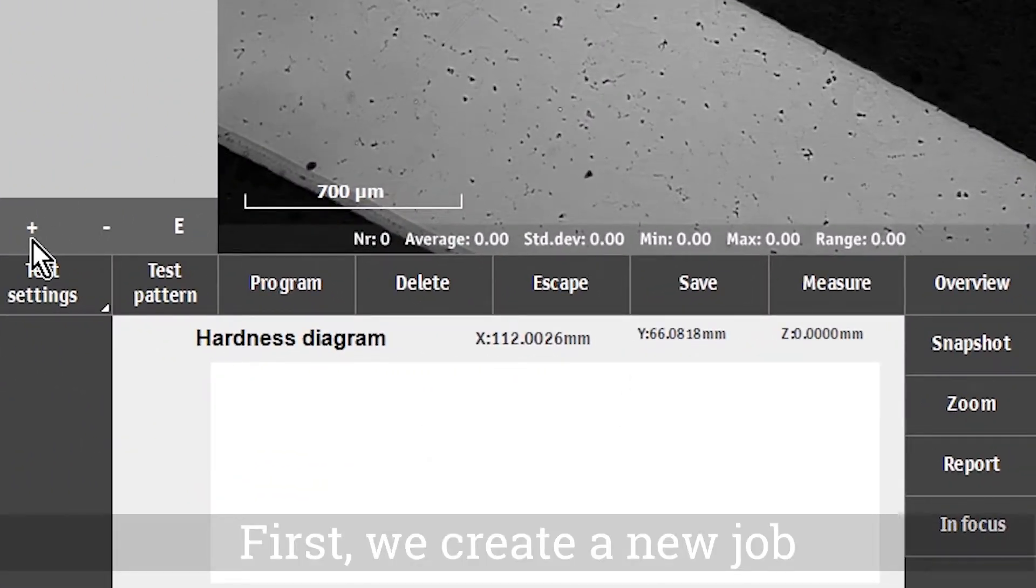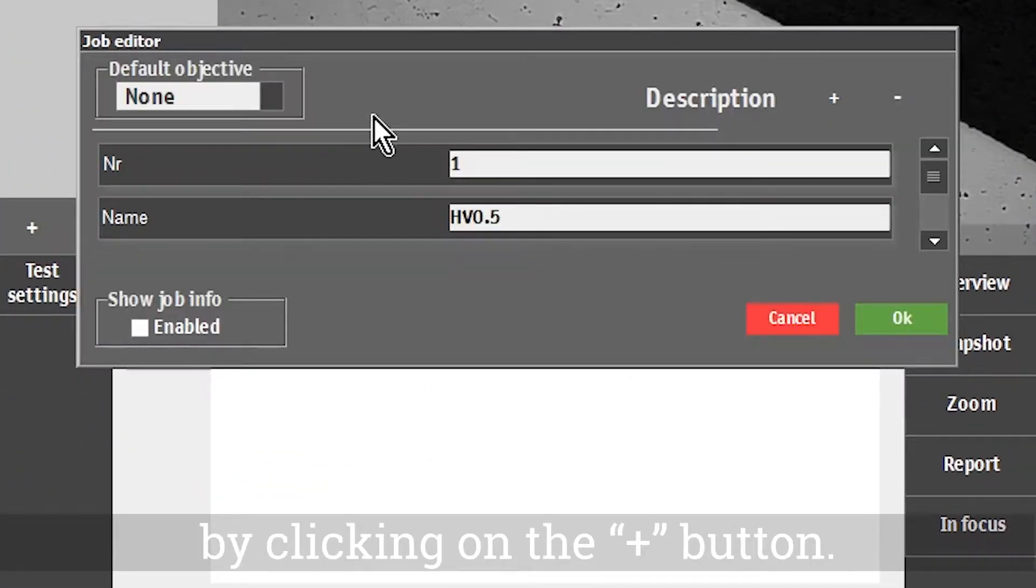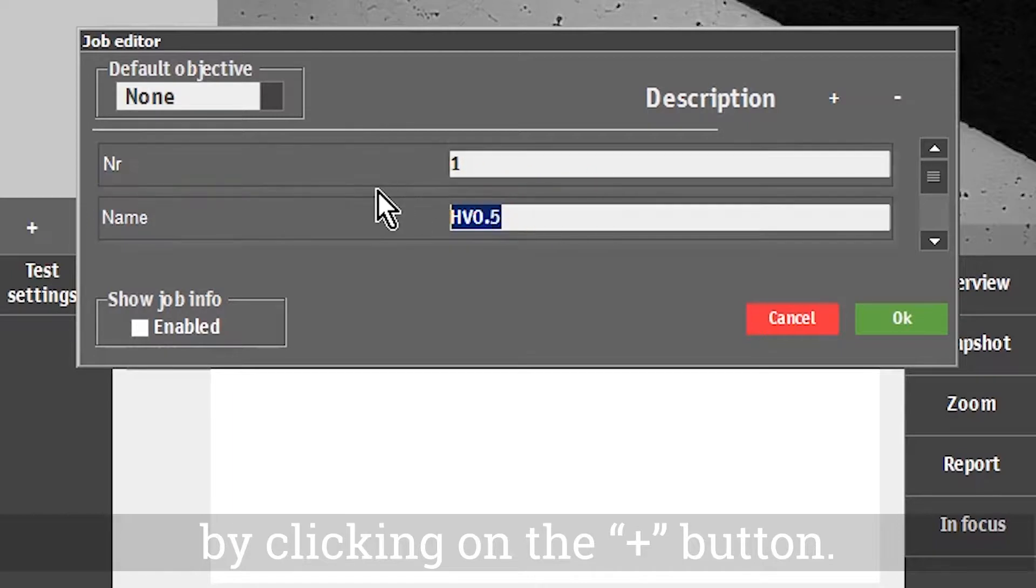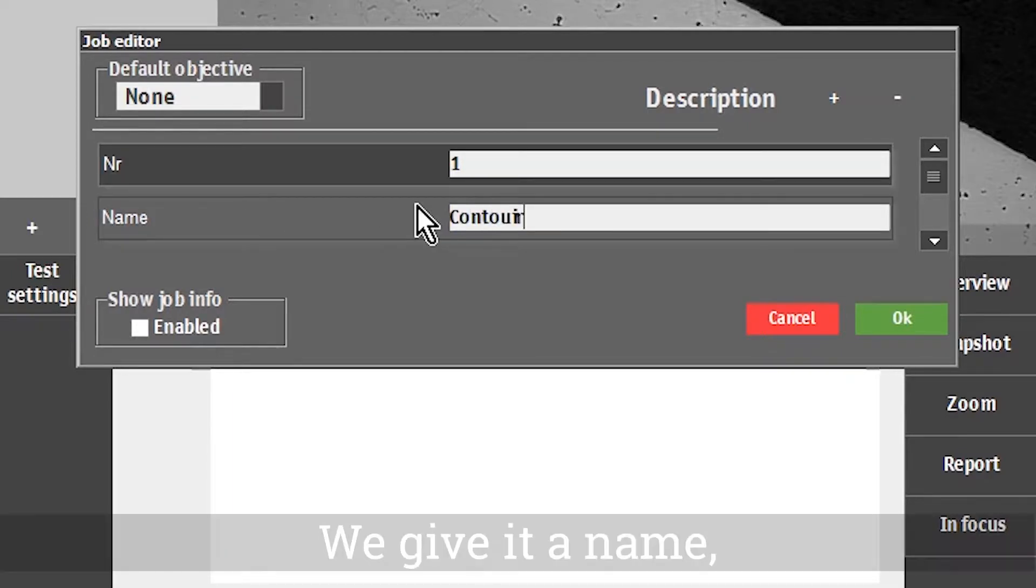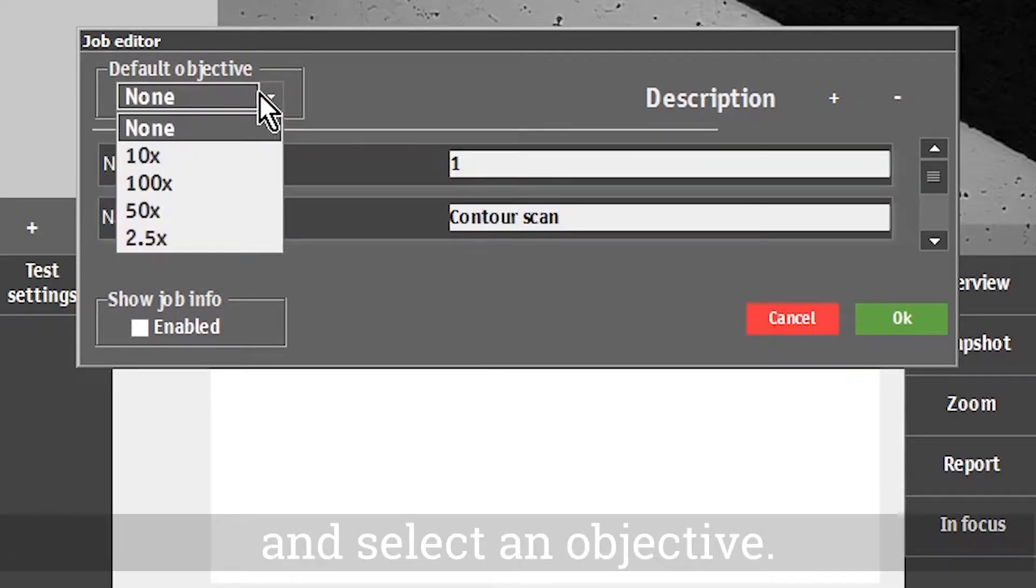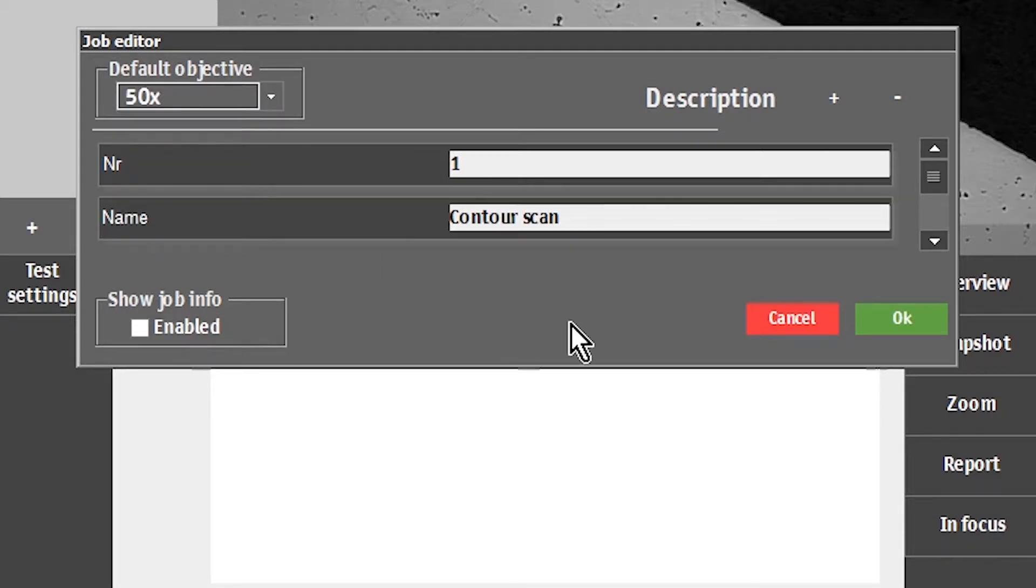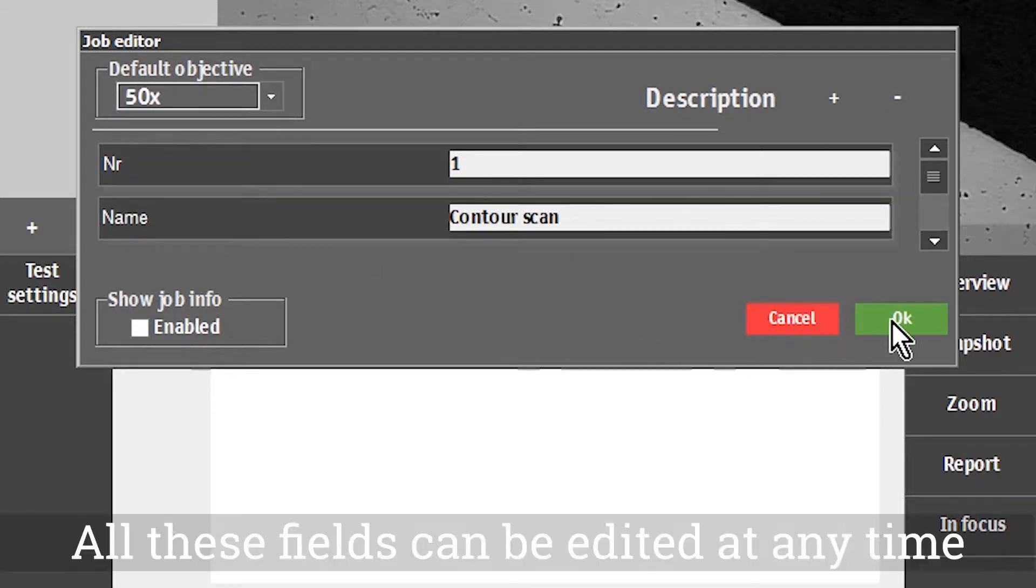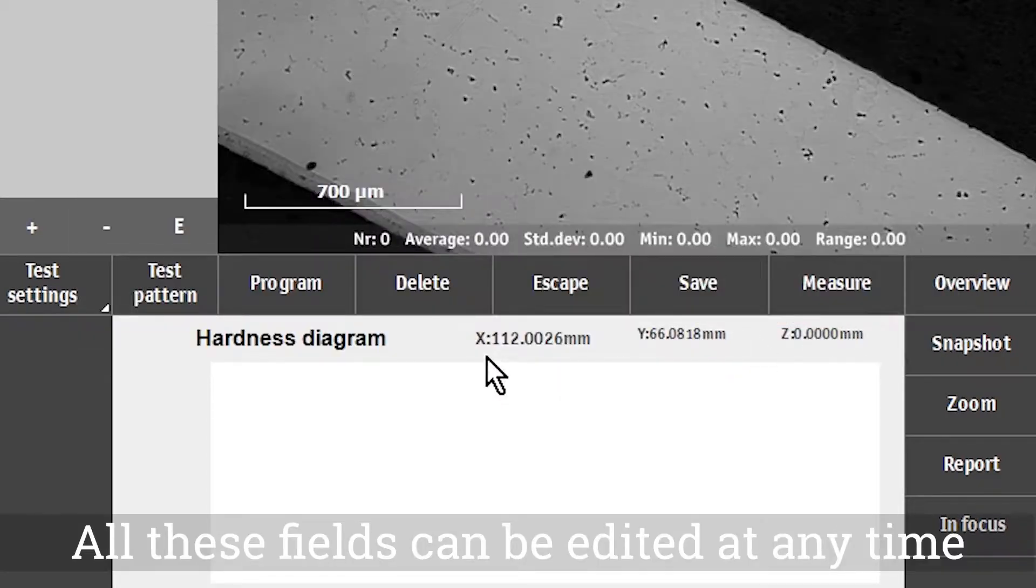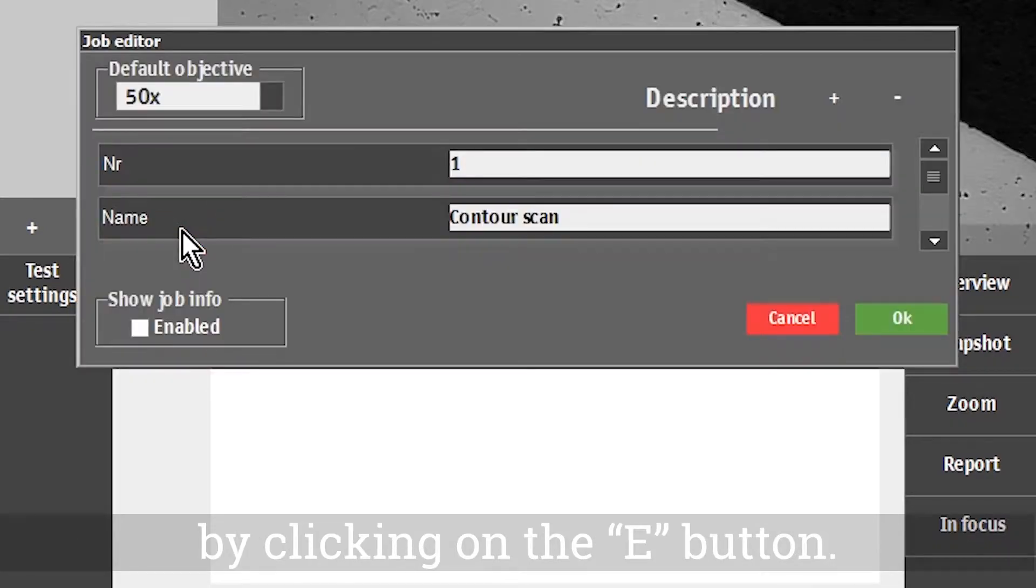First, we create a new job by clicking on the plus button. We give it a name and select an objective. All these fields can be edited at any time by clicking on the E button.